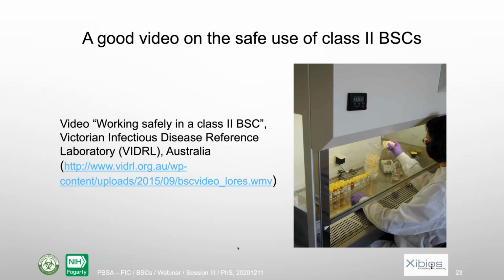I just mentioned this video. I will not show it. It's a little bit long, but there are a number of videos about working safely in a Class II biosafety cabinet on the web. This one I think is very well done. So I would recommend that if you have some time, have a look at it.